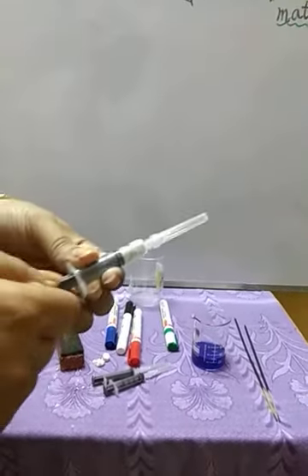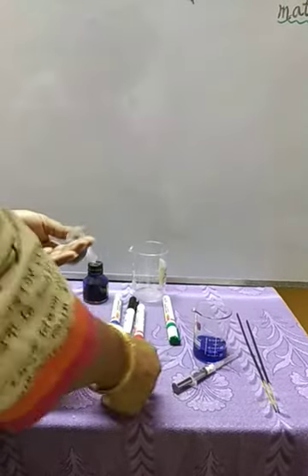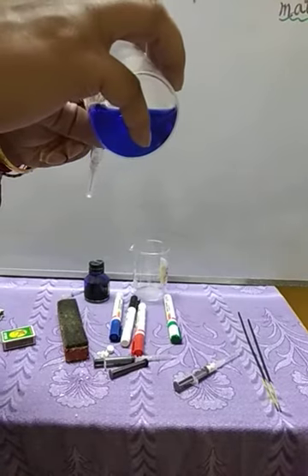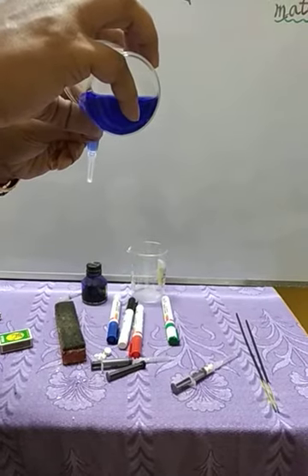Next, the same thing we are going to do with liquid. So here in another syringe I'm going to take some colored water.